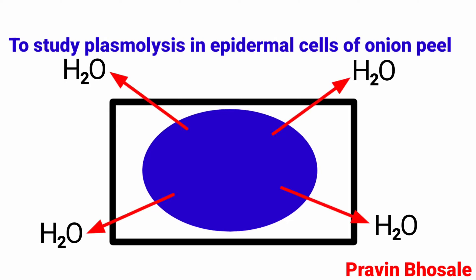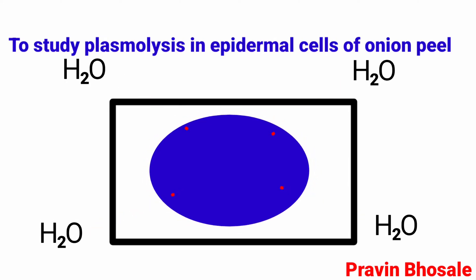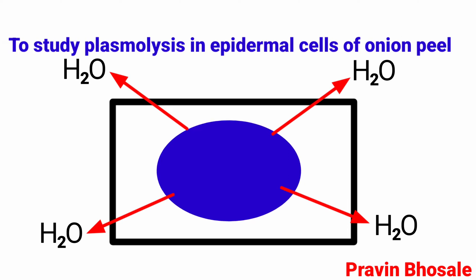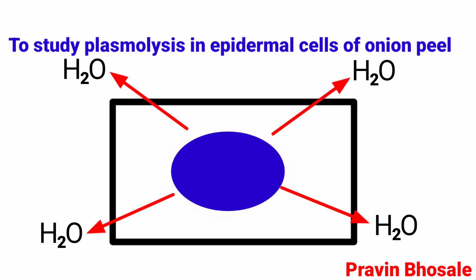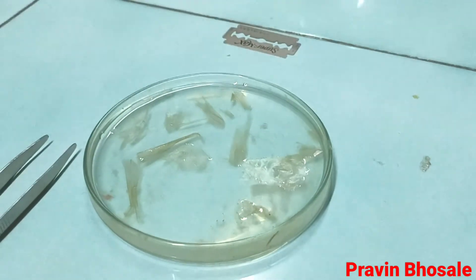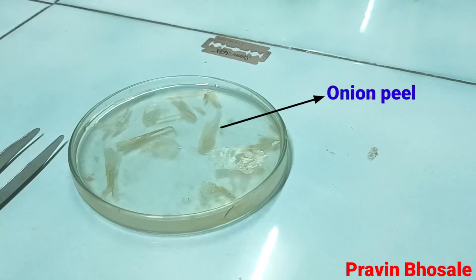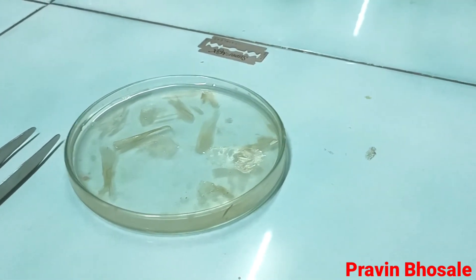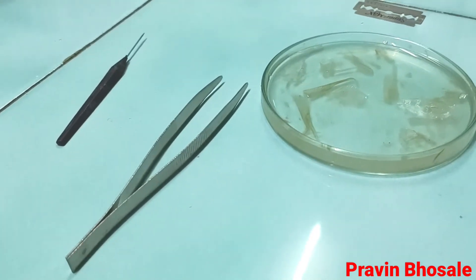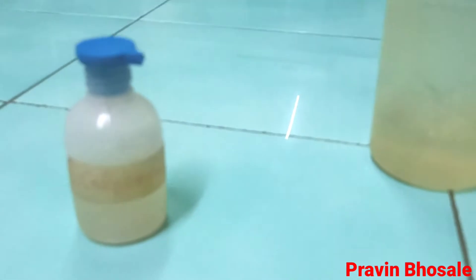Hello students, today I will perform an experiment aimed to study plasmolysis in epidermal cells of onion peel. Normally we use Tradescantia leaf. Let's see the requirements: these are the onion peels, then we require forcep, needle, and blade.